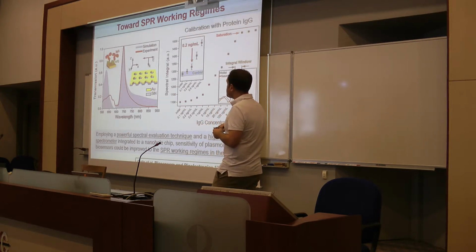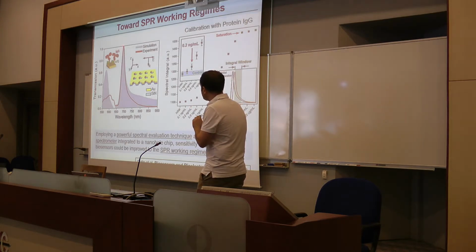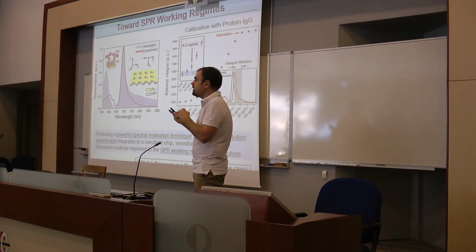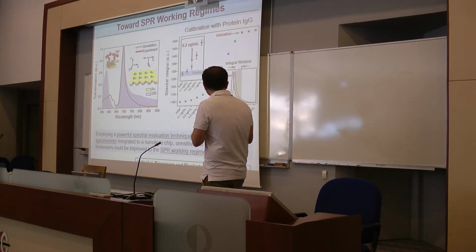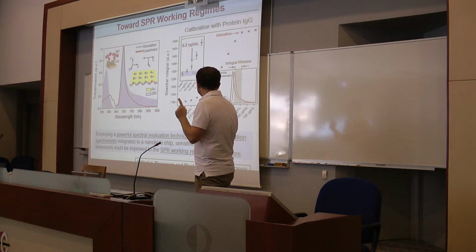In the classical studies using plasmonic nanohole arrays, the readout mechanism is to simply stick to the maximum transmission spot and then monitor how it changes. But if you have a very low concentration of biological analytes, this method is not sufficient to detect picogram per mil type of concentration. So what I did here is, instead of looking at spectral variations in only a single spectral location, we cumulatively monitor spectral variations in multiple spectral locations. I calculated the transmission response in a spectral window, and then added up all these spectral variations in a large spectral region of interest.